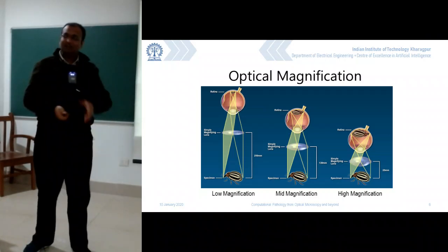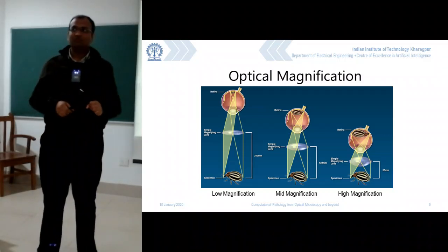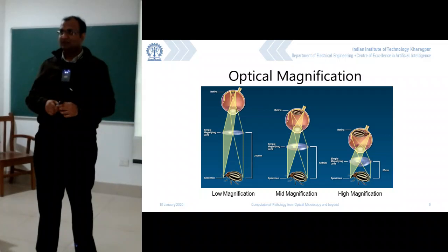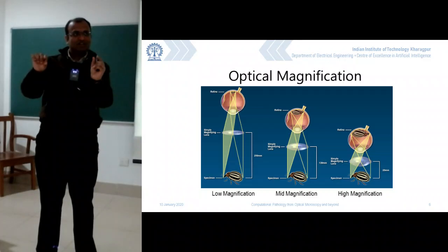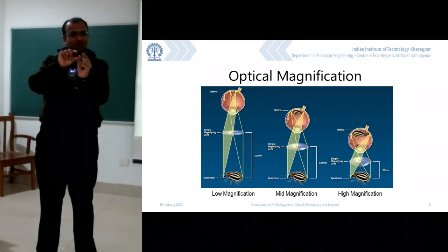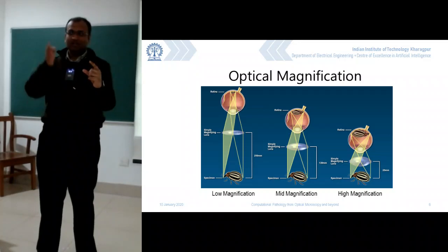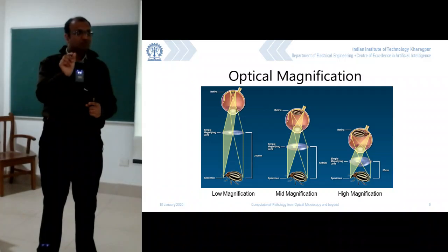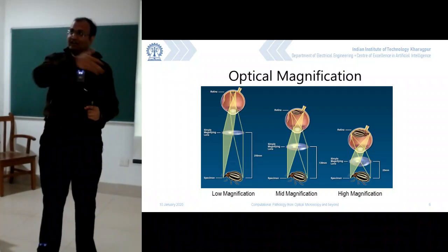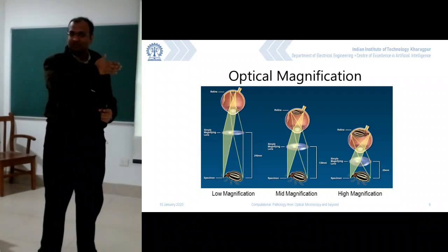Now in order to get rid of that, these guys are very clever. What they did is, let's try something else, which is called a virtual image and a virtual magnification. So if I have one lens that is going to cast an image somewhere, I take the other lens and place it such that the image from the first lens becomes the object plane for my second lens. So I can now cumulatively keep on stacking more and more lenses which are thinner and also of lower magnification factor, but because I have stacked a lot of lenses, I can get a cumulative magnification factor which is very high. I should be able to do that, right?